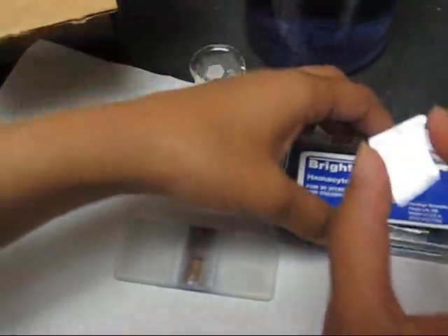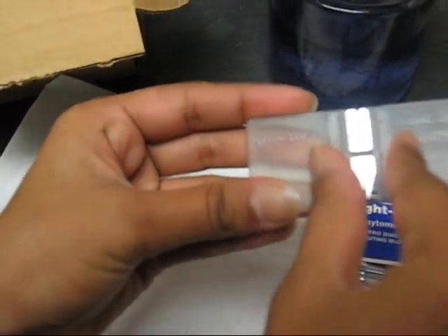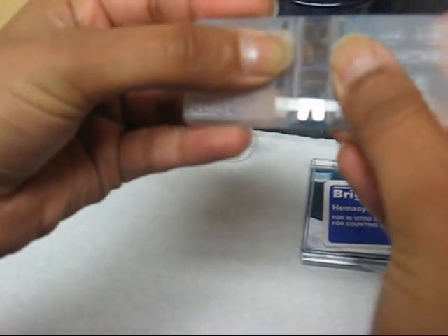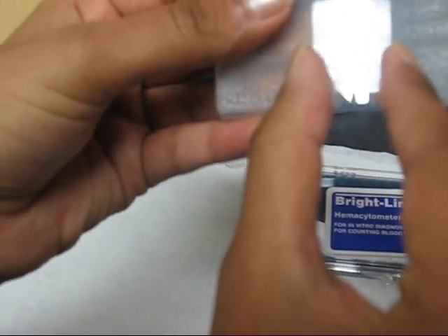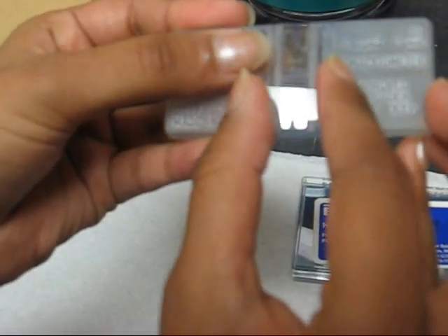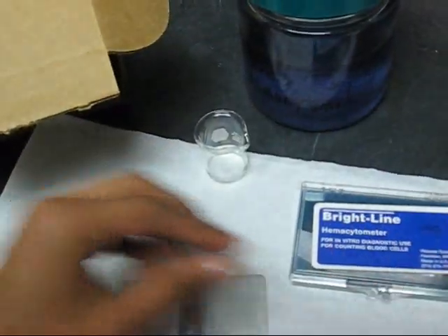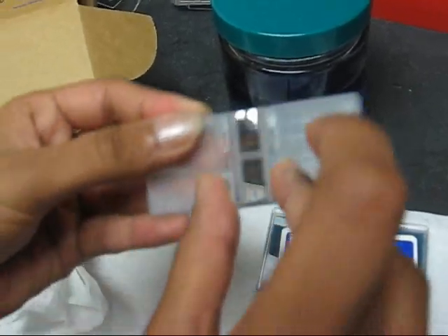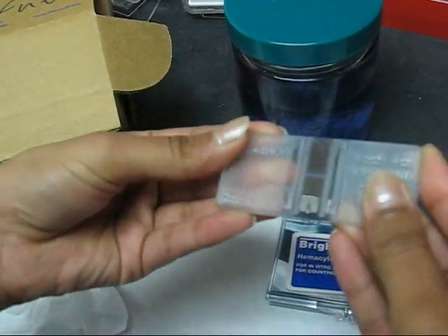Then take the glass slide, wipe it with the Kimwipes, and carefully place it on the center of the hemocytometer. To make sure it is tightly on the center section, try to move it around and make sure it does not slide off completely. If it slides off, wipe it down again to remove excess water and place it on the hemocytometer again, and it will stick.